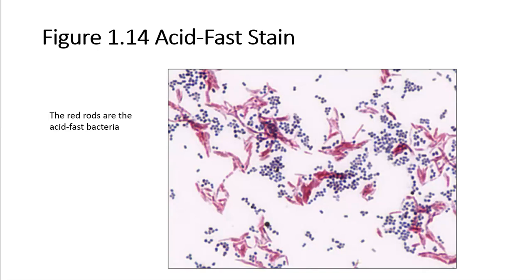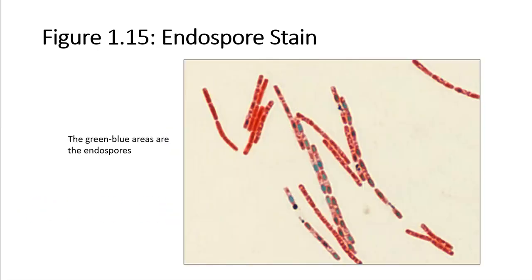And again, it's a two-color stain. It's a special way of doing it, and you can see these acid-fast bacilli against a staph that we use as a control sometimes. Okay, but again, two different colors, and we can tell the shapes. So a lot more information on these differential stains.